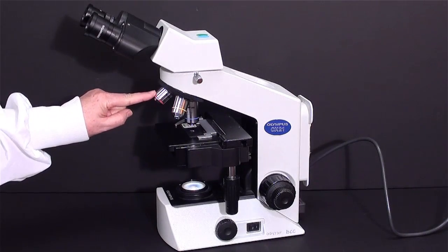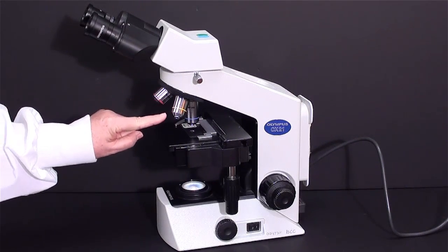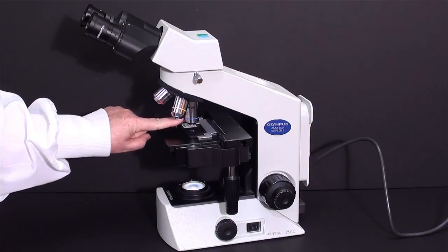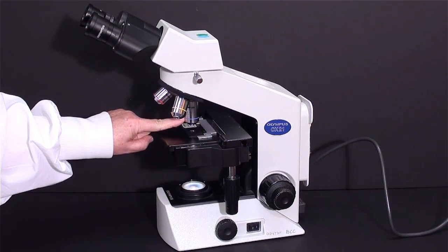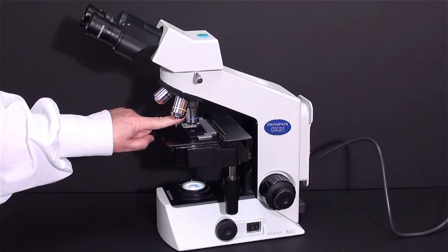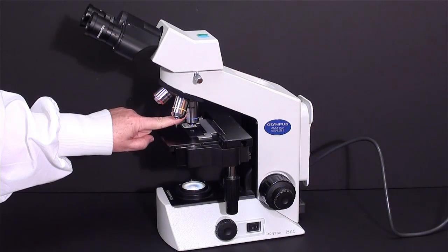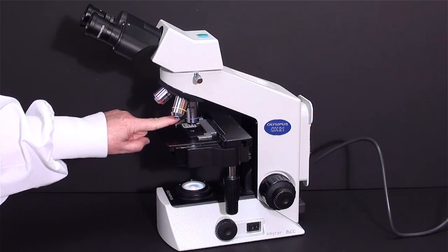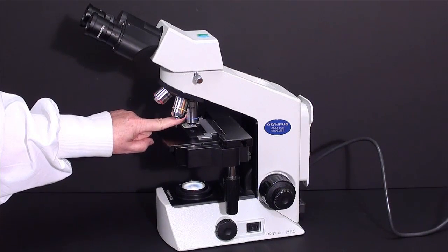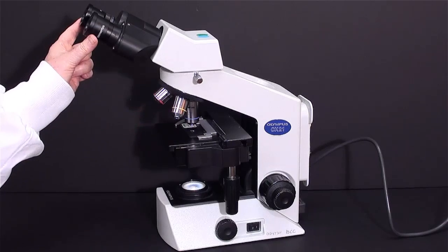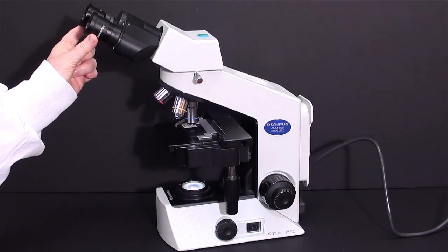These three objective lenses are called the scanning lens, the low power lens, and the high powered lens. When the high powered lens is in position, you have a total magnification of 400. 40x being provided by this lens and 10 by the eyepiece or ocular lenses.